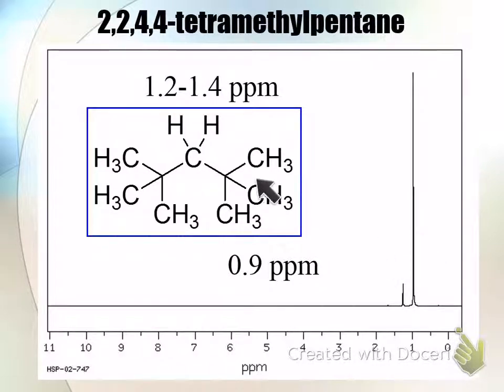If you look at these two, these are 1.2 to 1.4. That's this guy here. It's about 1/9 the signal of this in terms of amplitude, but if you calculate the area, it should be almost exactly 1/9. So remember I said the signal is proportional to how much you have, okay?